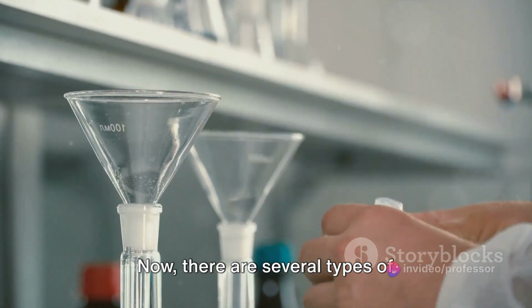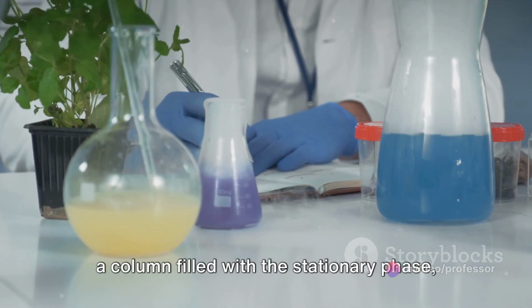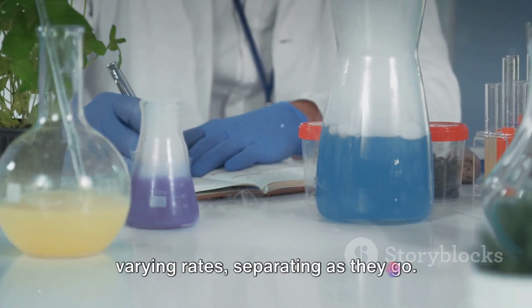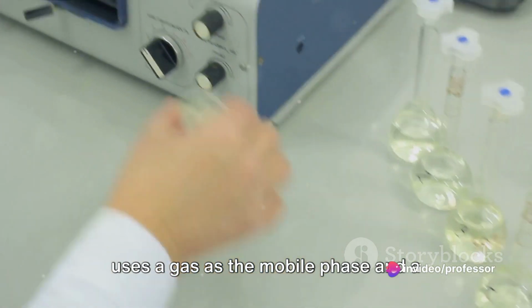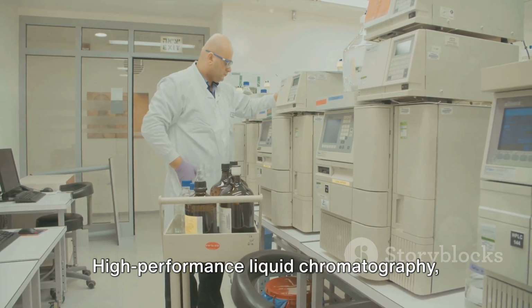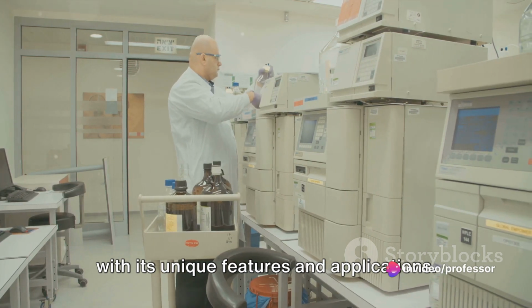Now, there are several types of chromatography techniques, each with its unique approach. Column chromatography, for instance, uses a column filled with the stationary phase, and the mixture is poured in at the top. The components then trickle down at varying rates, separating as they go. Gas chromatography, on the other hand, uses a gas as the mobile phase and a coated glass or metal as the stationary phase. High-performance liquid chromatography, thin layer chromatography, paper chromatography. The list goes on, each with its unique features and applications.